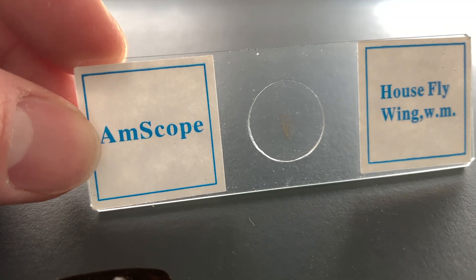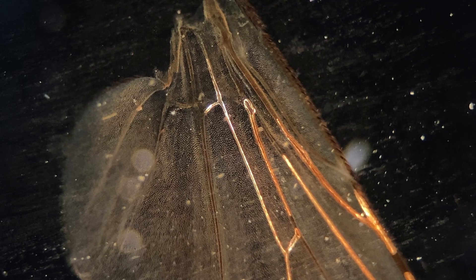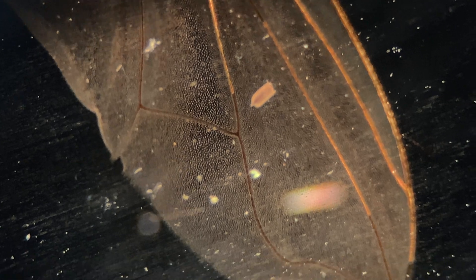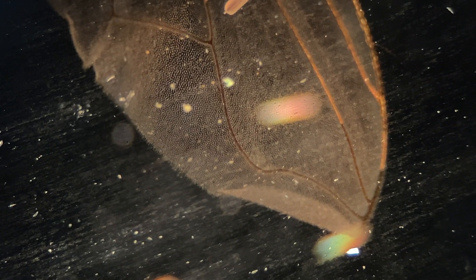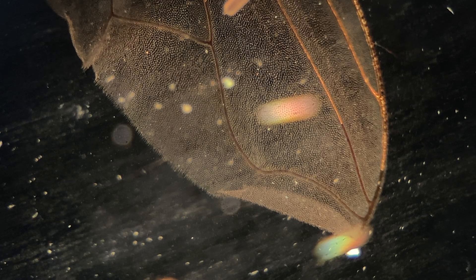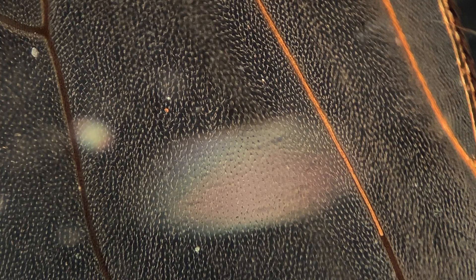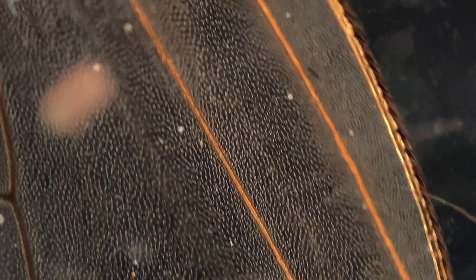Now I wanted to start off with some housefly wings. This was a prepared slide from Amscope — they do a pretty good job with prepared slides. So this is just a regular housefly wing under the microscope at about 40 times magnification, and I'll zoom in in just a second. This is also under dark field — it's really cool when you look at it. When I zoom in here, it kind of looks a little bit hairy.